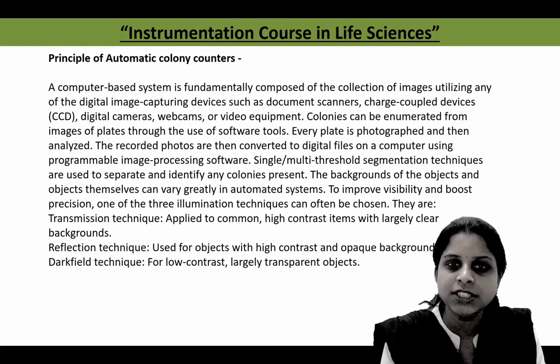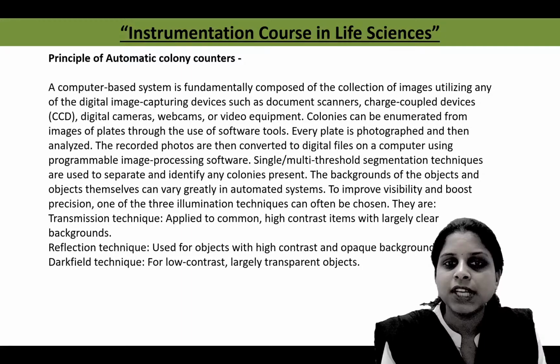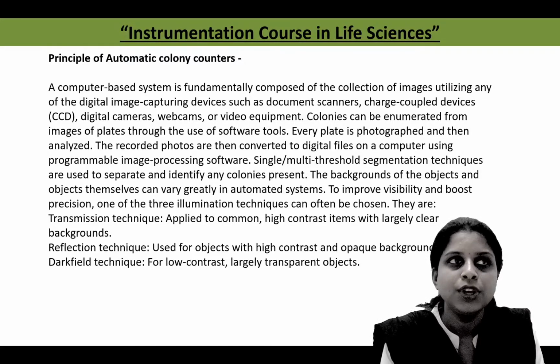In simple language, first, automated colony counters take the image of the plate on which colonies are to be counted. Every plate is photographed and then analyzed. The recorded photos are then converted into digital files on a computer using programmable image processing software. Single or multi-threshold segmentation techniques are used to separate and identify the colonies present on the plate. The background and the objects themselves can vary greatly in an automated system. To improve the visibility and boost precision, one of three illumination techniques can be chosen.